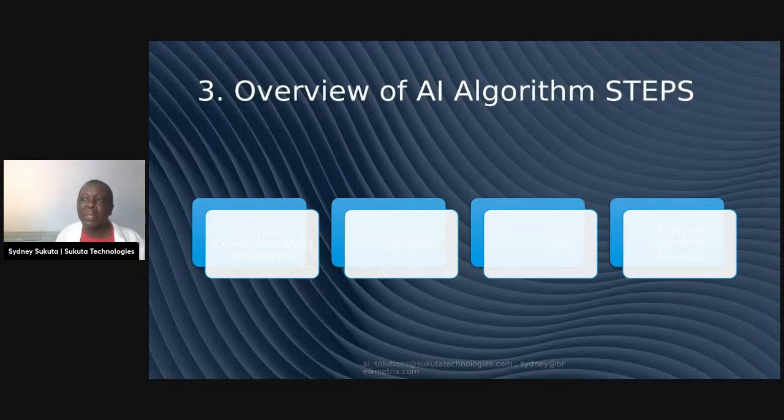Basically, you look for something where you already know the answer, scan it with light, and see if you get the correct answer. Once we do that, and we have reasonable error, it won't be exact, maybe plus or minus 5%, that's the criteria established. We go into deployment. That's our last phase here, sample deployment.